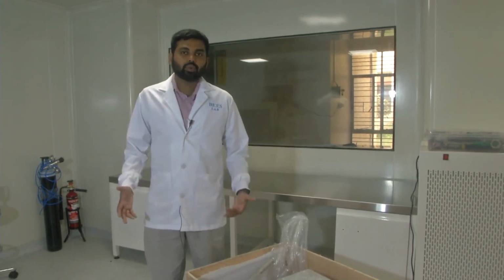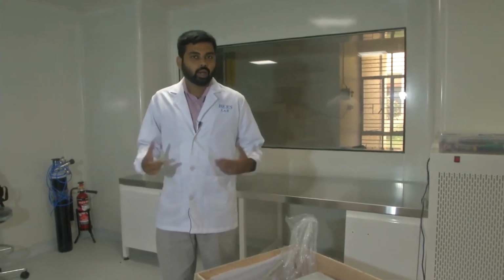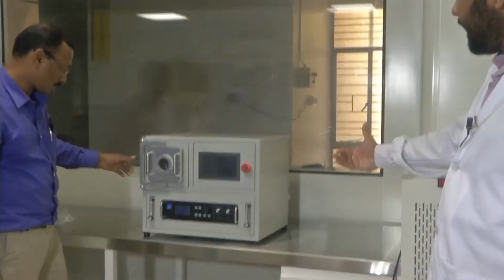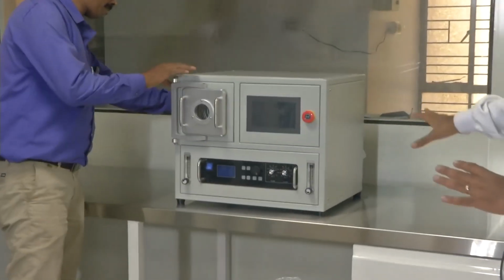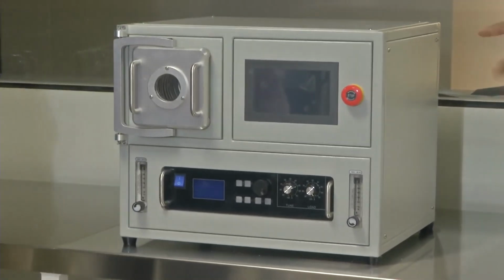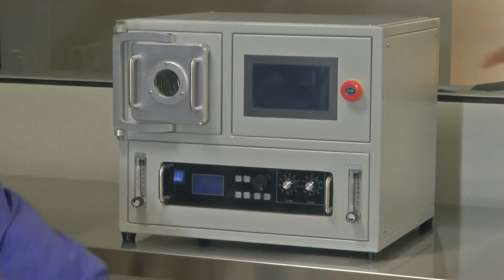Now let us dive into the installation, and then I will run you through it. So we are setting this thing up. The chamber is there, we have just opened the bag and kept it now. You can see how a little bit sophisticated it is. We will tell you what each port does in due course of time when we actually show you the bonding process.